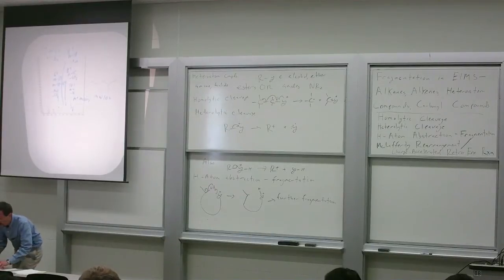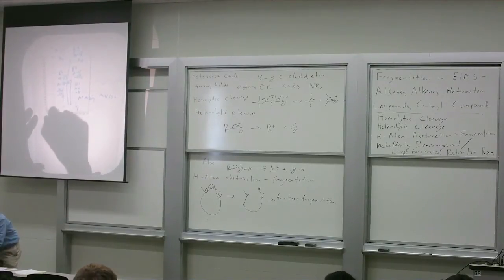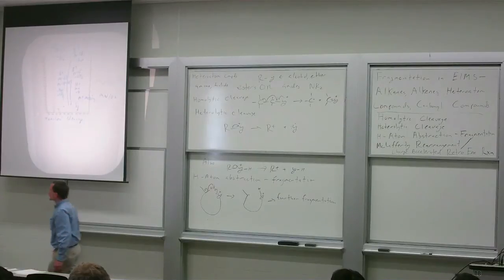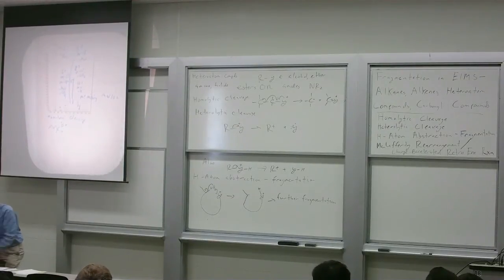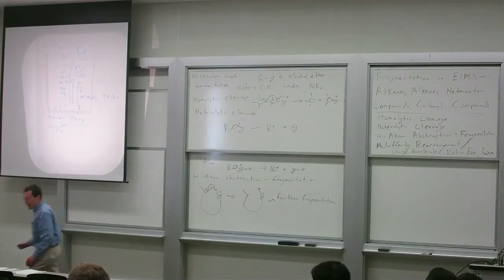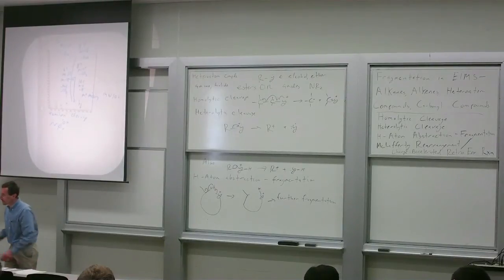So let us begin with our homolytic cleavage pathway. And let us apply this principle relatively indiscriminately. In other words, I'm simply going to start with my structure and say, how far will it get me if I work through all permutations and combinations of that fundamental homolytic cleavage pathway that we started with? In other words, if I go ahead and say, all right, we have three substituents off of the alpha carbon, and I'm going to give you the abbreviated mechanism. The abbreviated mechanism is the one where you only draw one fish hook rather than drawing multiple fish hooks.